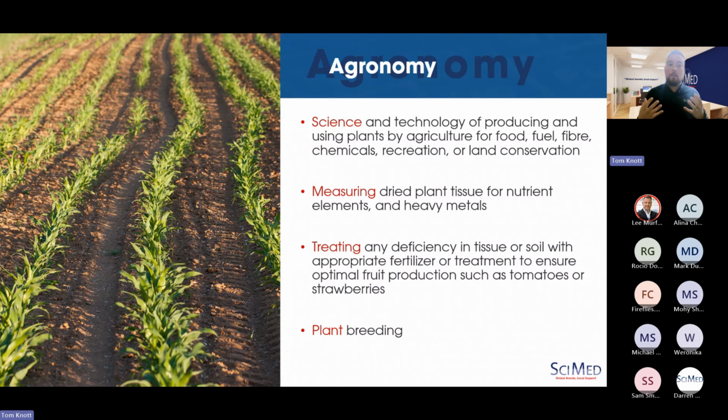And in doing so, approach soil conditioning, and in other interesting areas, plant breeding as well can help selective breeding in terms of the uptake of certain nutrients, certain elements. You can gear it in all these sorts of ways by having on-site instant monitoring of the elemental composition of both the soil and ultimately the plant.